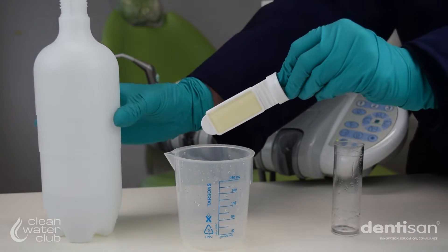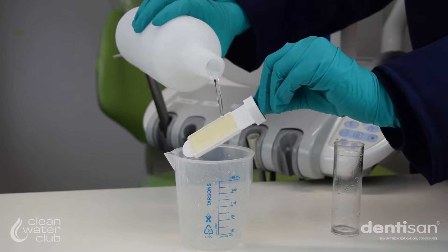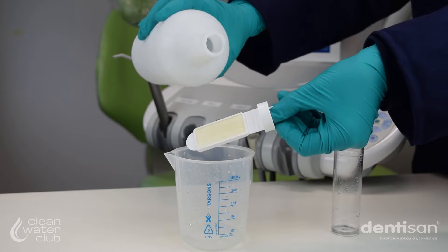Take the source of your input water and gently pour a small quantity of water over each side of the dip slide panel, ensuring the paddle is completely covered.